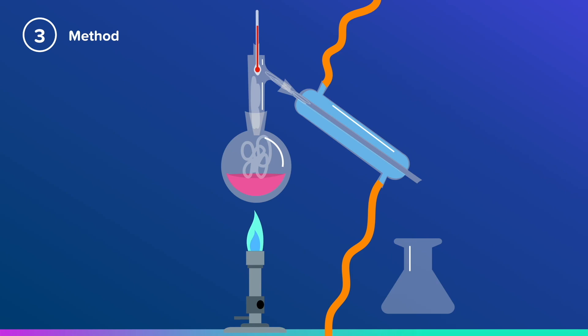You're going to need to move your Bunsen burner in and out to allow it to cool and heat up. You can use the thermometer to check the temperature is really at boiling point. You don't want it to be higher than boiling point, as other liquids may evaporate.